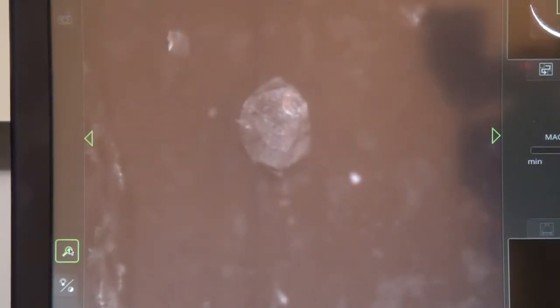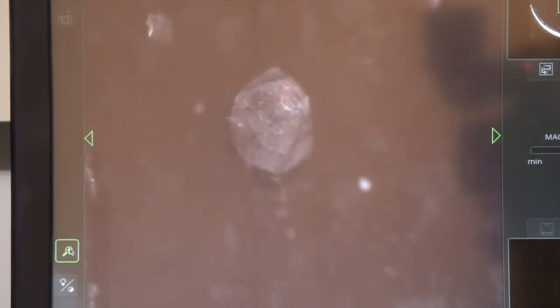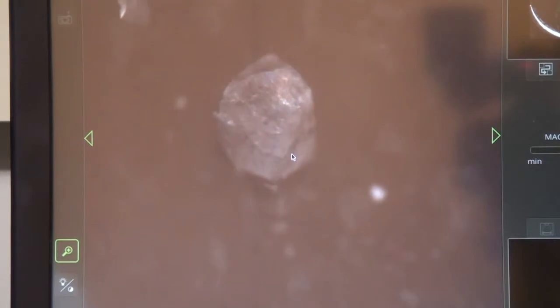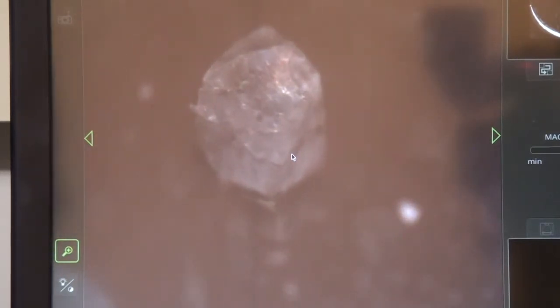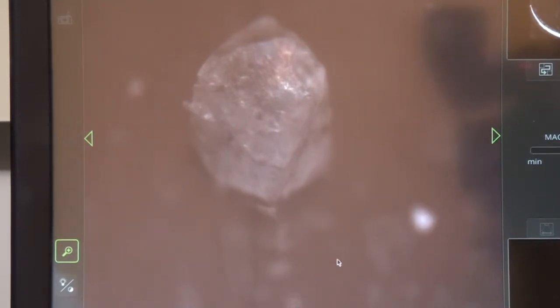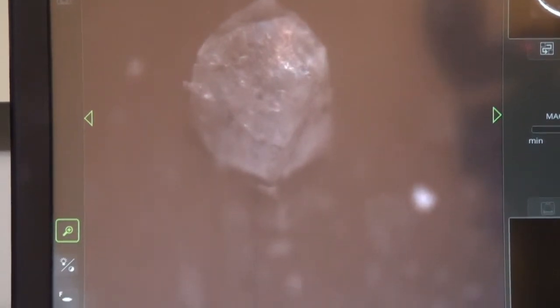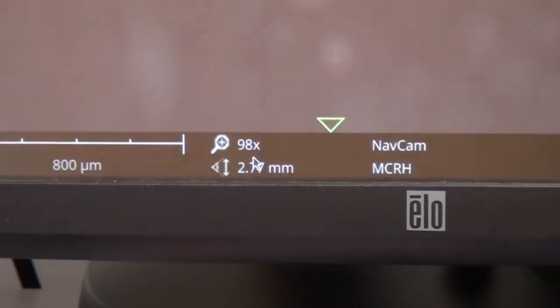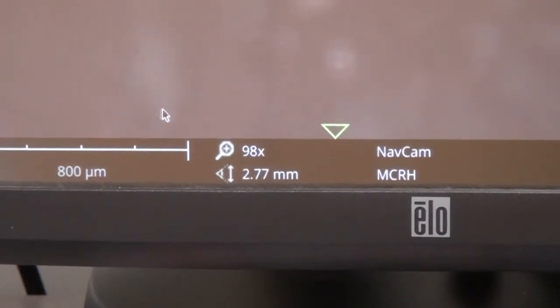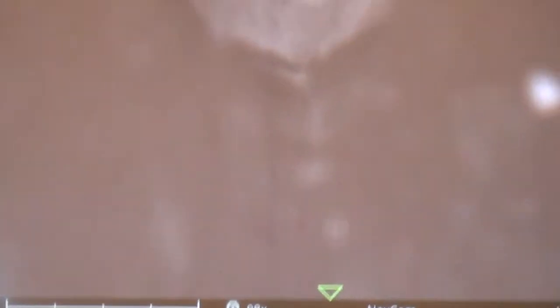This is a beautiful sample and looks almost translucent, and the tiny ridges and the topography is becoming more visible, magnified. Just a touch of pink there. Magnification is almost 100 times now. And now we'll switch to SEM mode.